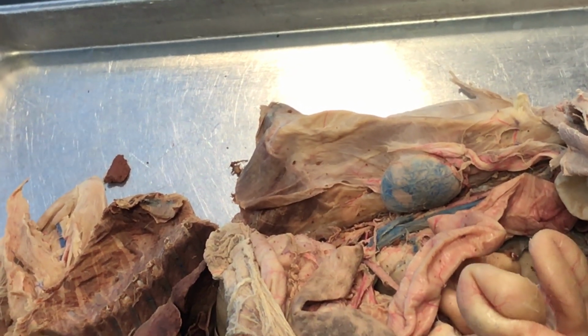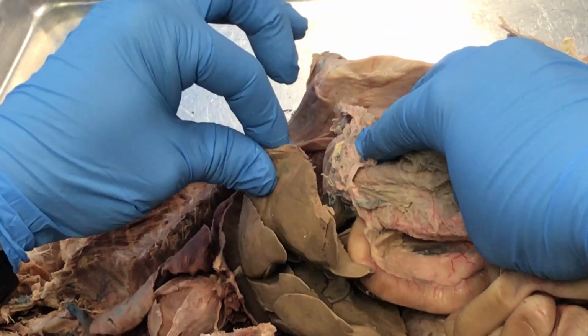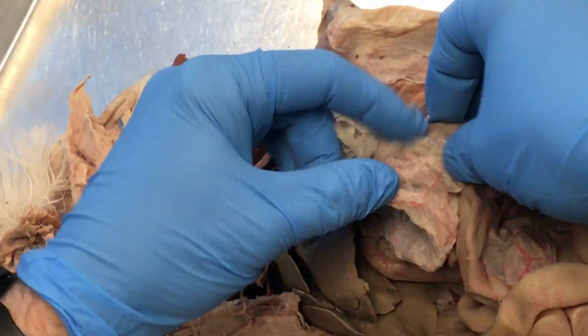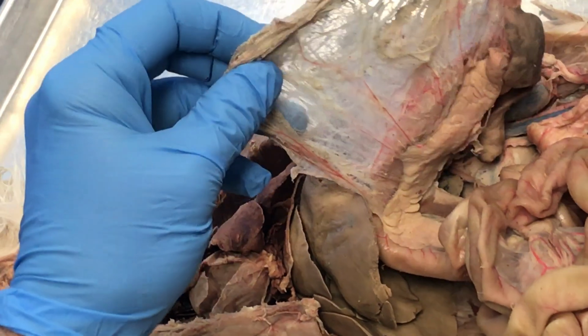Parietal liver. Liver's right here. This is the liver, right? That's liver. Greater omentum. The greater omentum is a double layer of mesentery again. So this is the greater omentum.